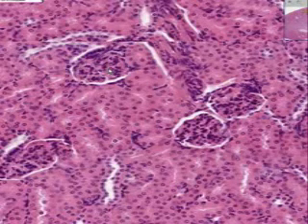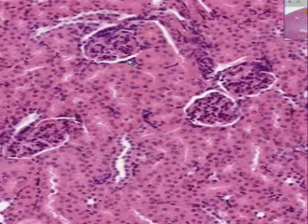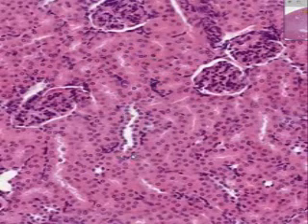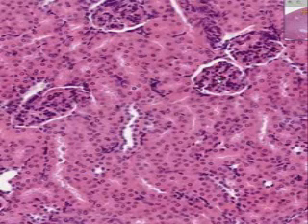Here's all proximal, here's all distal, here's a glomerulus. You know the 3 types of cells in the glomerulus. You know that the outside is lined by the parietal Bowman cell. You know that the visceral Bowman cell is called the podocyte. You know that the other 2 types of cells in the glomerulus have to be mesangial cells and capillary endothelial cells. We've already seen the beautiful, beautiful deeper part of the kidney called the medulla.